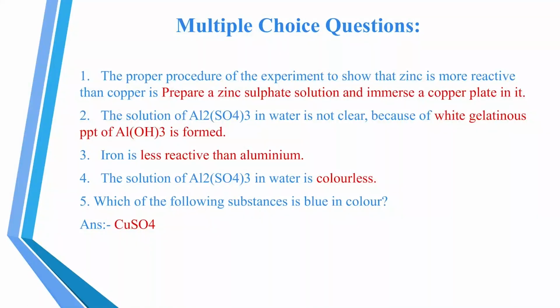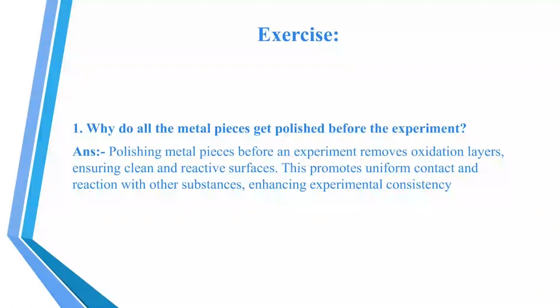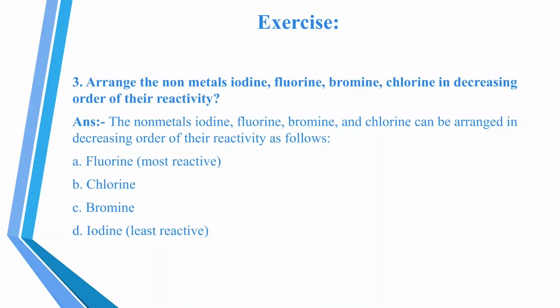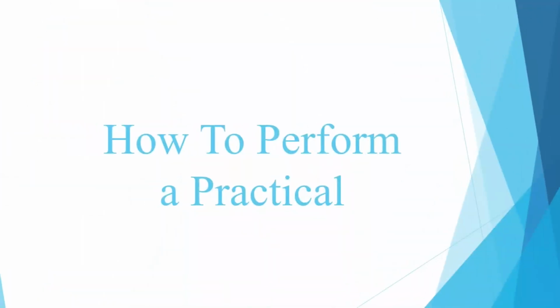Write the solution of the exercise in your journal in neat and clean handwriting with a blue pen. How to perform the practical.